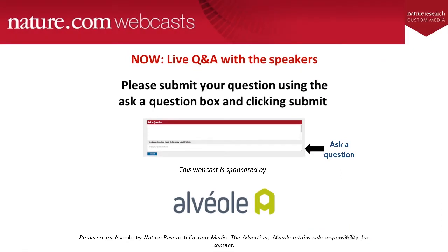Thank you for your presentation, Leeya. It's now time for the Q&A. So I'll ask Leeya a question, just type it in where it says type your question here and then press submit. Our first question, Leeya, asks, when performing cell culture on micropatterned EM grids, are you limited by time? And this person also asks, does the surface coating or pattern expire at some point in time?